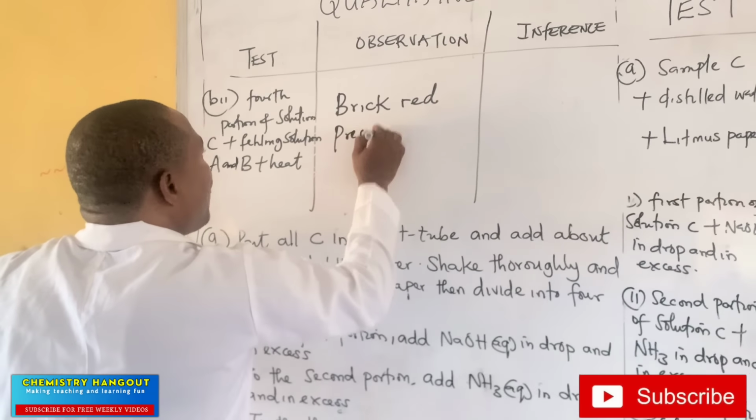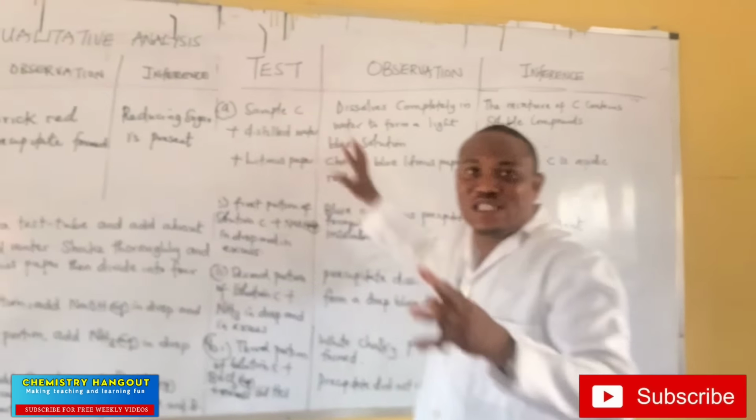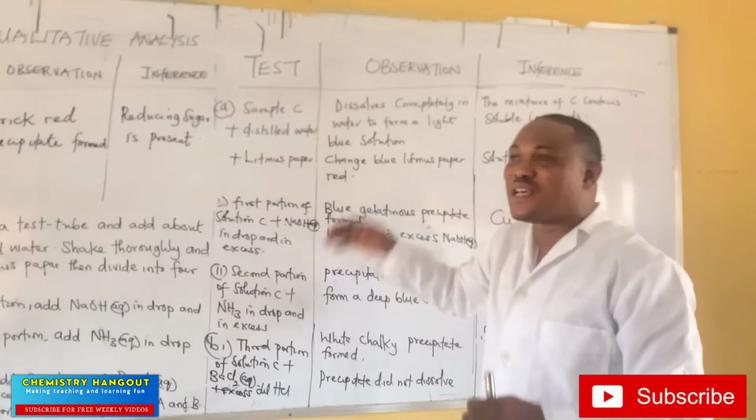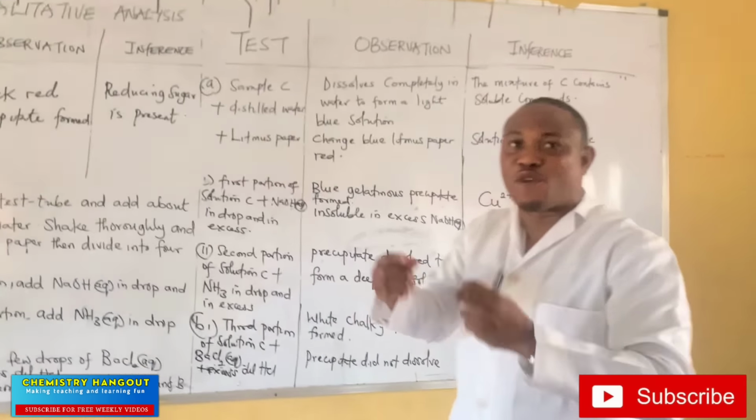Which means they can decide to give you 3 out of all these things we have done, or they decide to give you 4. But from our experience, and from us sitting down to analyze it, these are the possible tests on that day. If you see litmus paper, why are you doing the test again? You have already done it. So if you understand this table we have prepared, you should not find it difficult. Imagine you are seeing it on that day.